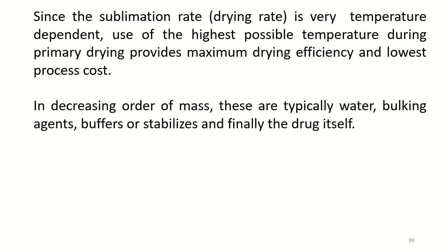Since the sublimation rate, which is actually the drying rate, is very temperature dependent, use of the highest possible temperature during primary drying provides maximum drying efficiency and lowest process cost.